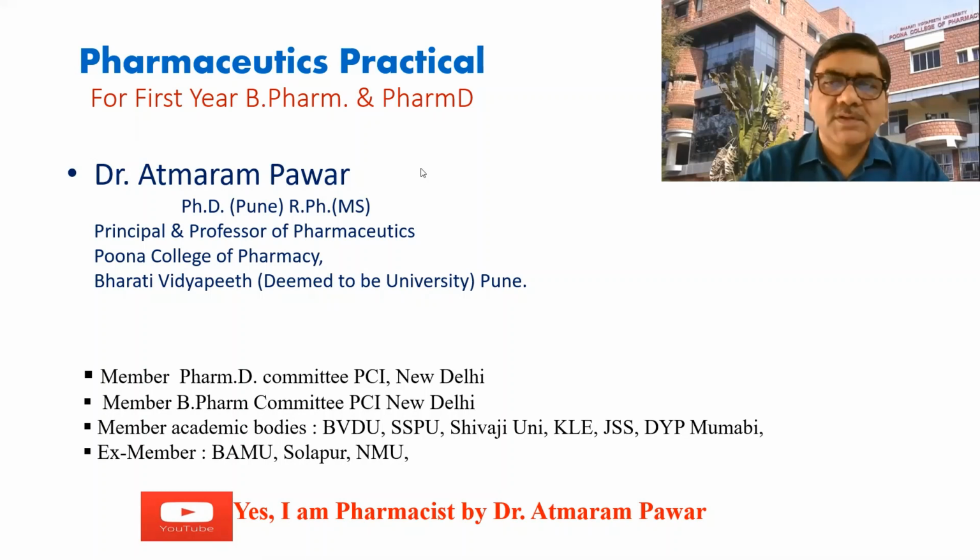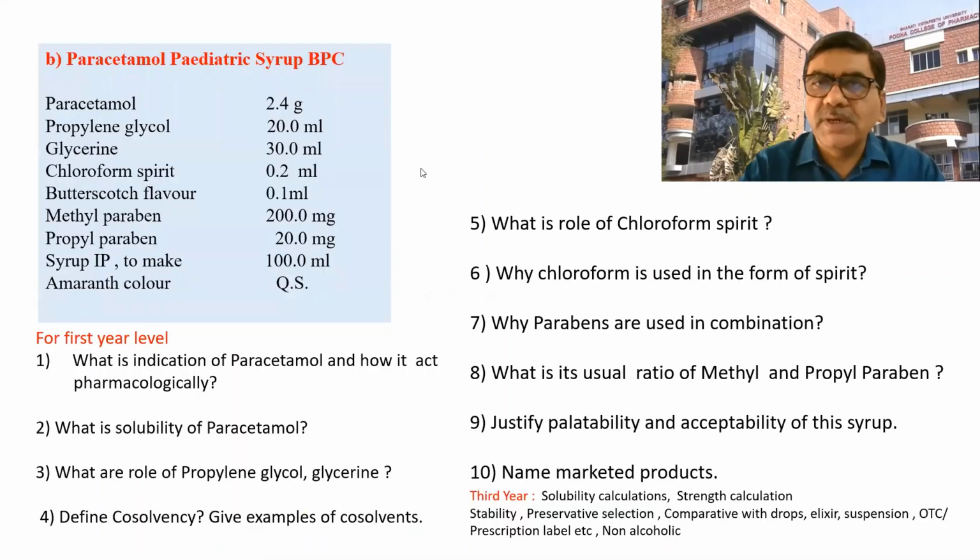So till now we covered the additives like syrup, flavored syrup, and one medicated syrup, that is the Vasaka syrup. So today we will see this paracetamol pediatric syrup.